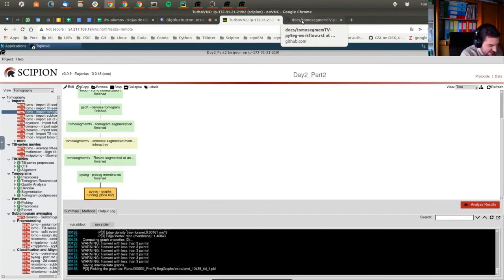But in this case, the graphs calculations are being carried out via third-party software called Disperse, which I don't know if it's possible. Maybe Antonio can clarify this. It's taking. Yeah. I don't know.